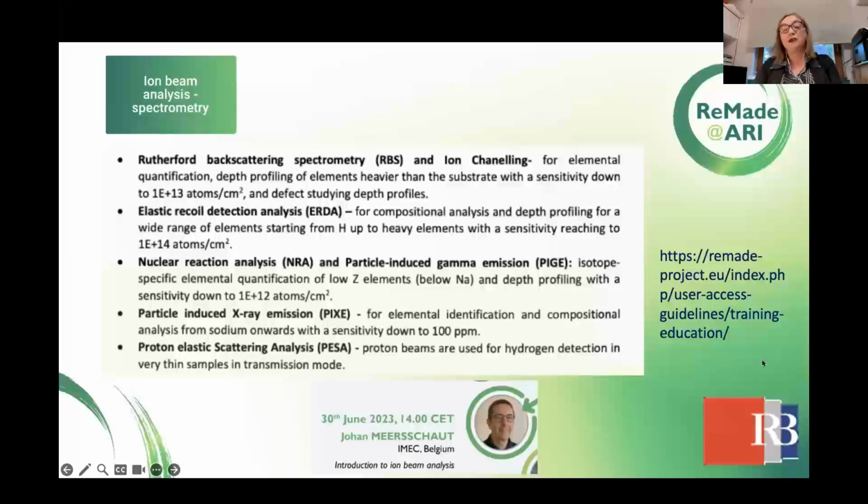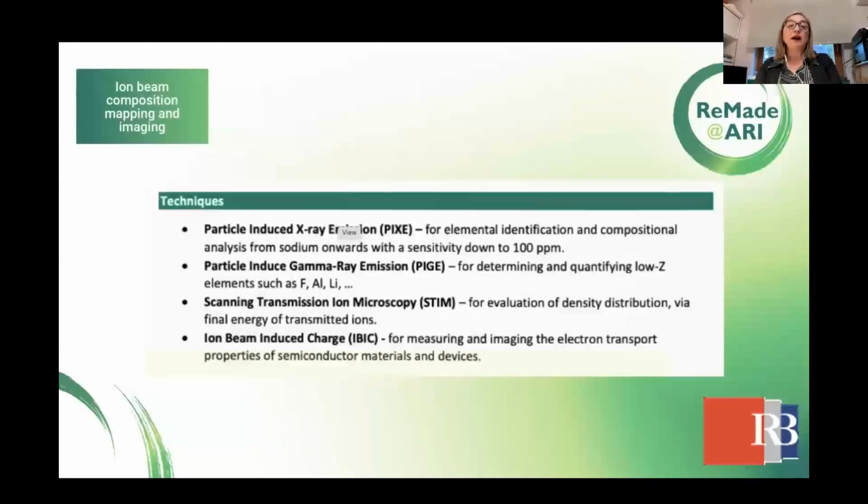He gave you an introduction about RBS, Rutherford backscattering and ion channeling, elastic recoil detection analysis, NRA nuclear reaction analysis, particle-induced X-ray emission, and proton elastic scattering analysis. If you want to see Johan's webinar one more time, it's recorded, and you can visit the YouTube channel and see the webinar again. So I will talk about the other three boxes today.